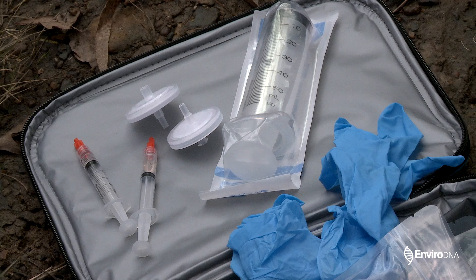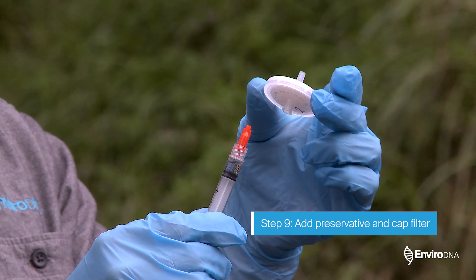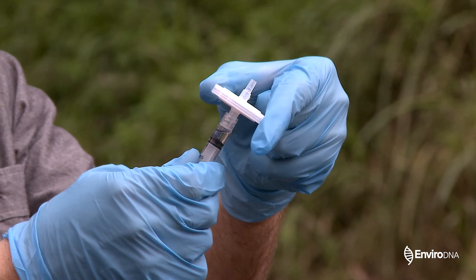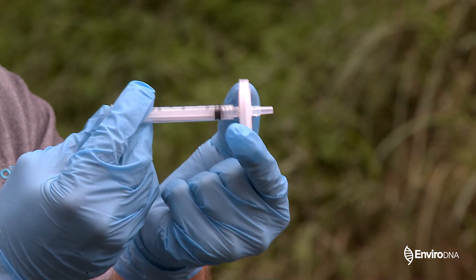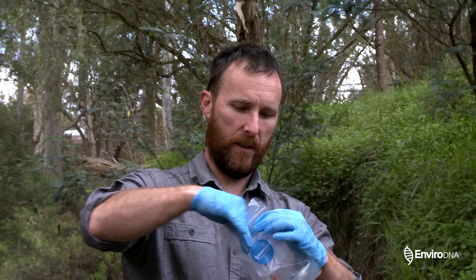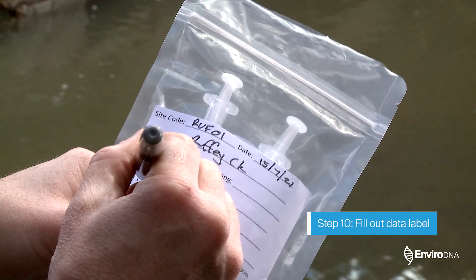Now I've got rid of any water in this filter, we're going to add the preservative — this is going to help preserve our sample before it gets to the lab and stop any DNA degradation. All we need to do is uncap the little syringe, screw it onto the filter just like we did with the large one, and then very gently add the preservative — it's going to fill up the filter a little bit and might dribble out, that's fine. Then we add the cap onto the end of the filter to seal it; the syringe stays attached, so the whole filter and syringe goes into the packet, and then we record the volume filtered for each filter and send that back to the lab.